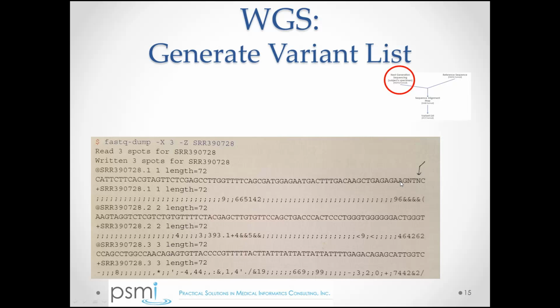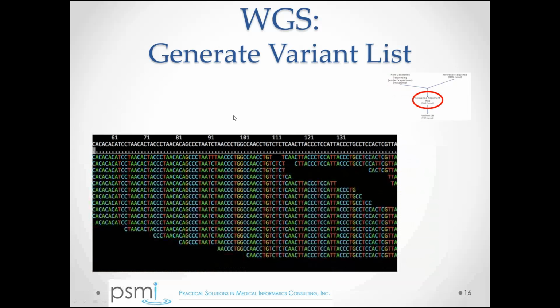So now we've taken all of those reads in the FASTQ format. Possibly we've filtered out the ones that have a poor quality score. And now each one of these reads, so each row here represents an individual read. And we now are aligning each one of these reads to the reference. So this would be the reference file. And this file that you have here now would be a sequence alignment map. And this particular file can be downloaded in a SAM format.